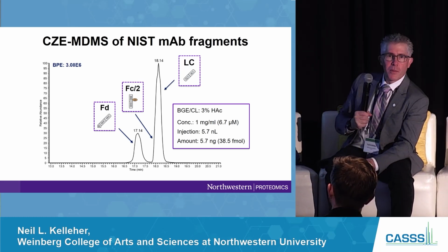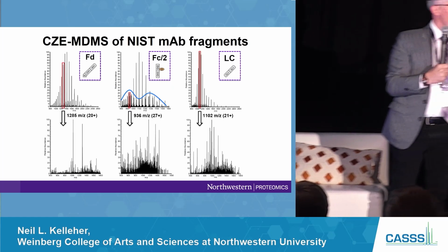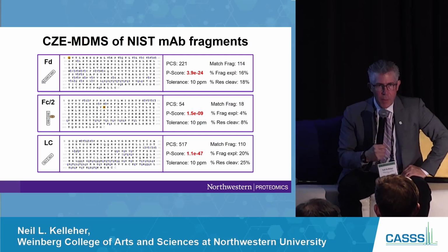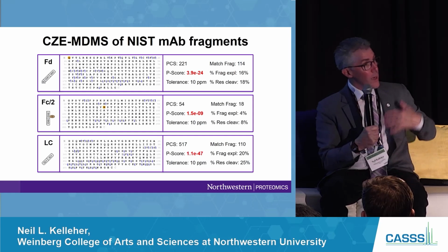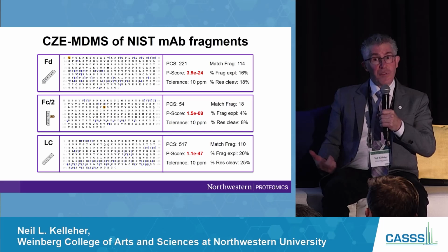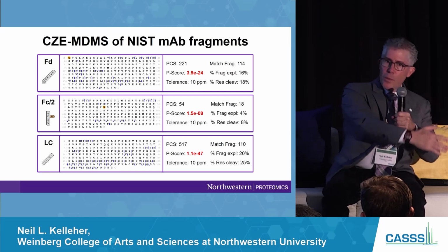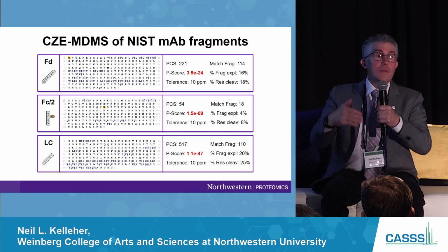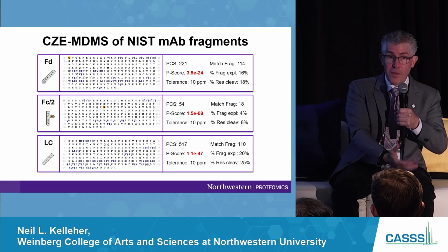If you have a 5-second wide peak, that's going to be tough because the unit of currency in middle-down and top-down is the number of fragment ions that you can observe per unit time, right? And the instruments have been optimized for bottom-up. The methods have been optimized for bottom-up. We as a community, especially in grad school, or the training that most of the pipeline gets, is speed for peptides. So that has an indirect effect towards top-down. They have become faster. And I use Thermo language because that's what I'm most familiar with. But as you go from the Lumos to the Eclipse to the Ascend, it is getting faster. There's something called Top Speed, and you can do a top 10 or top 12 type of data-dependent experiment. But each scan is not going to be 50 or 10 milliseconds.